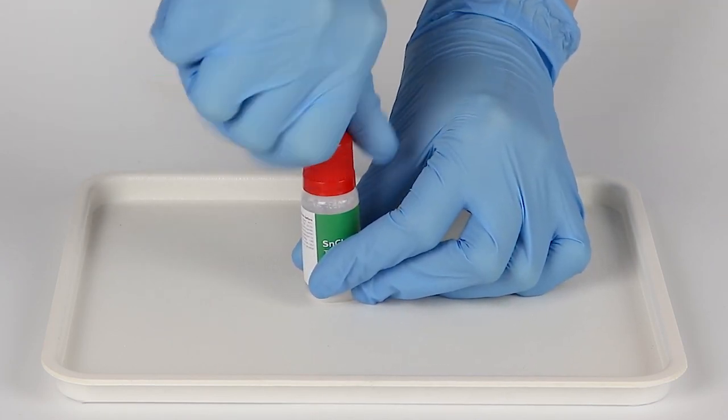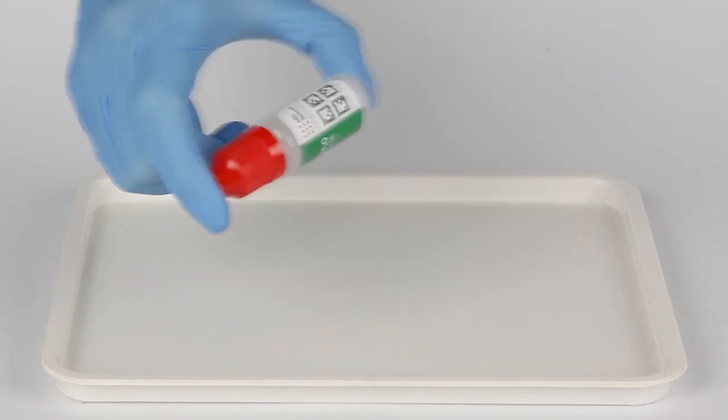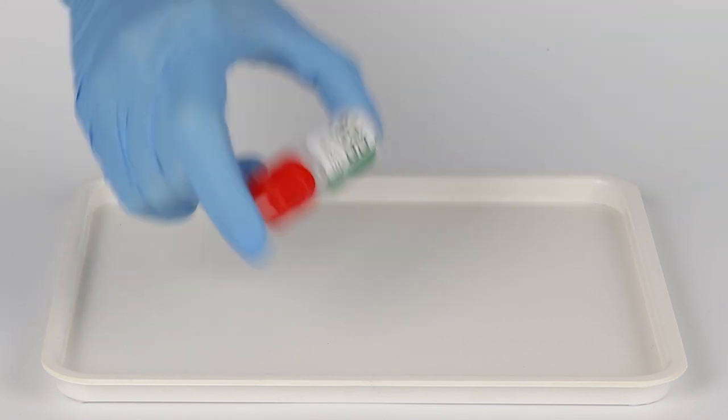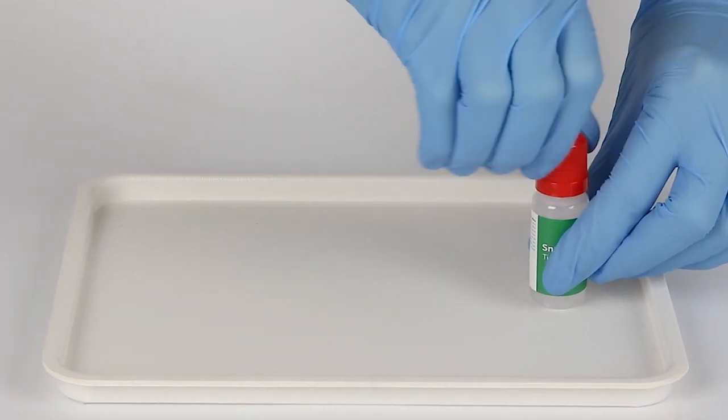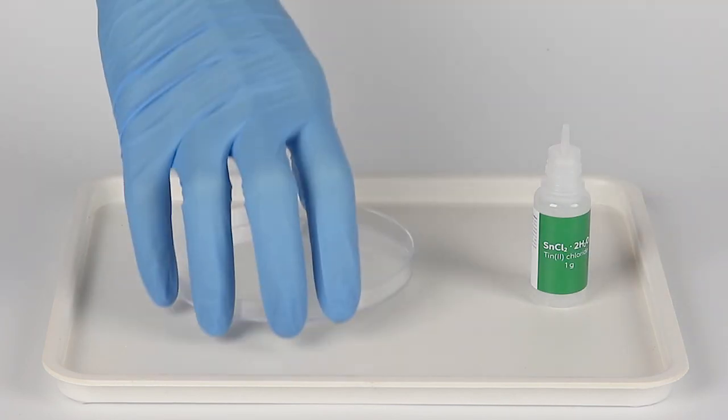As an alternative, you can use the white cap from the bottle of sodium hydrogen sulfate solution. Shake the bottle well to mix the contents. Then pour everything into the petri dish.